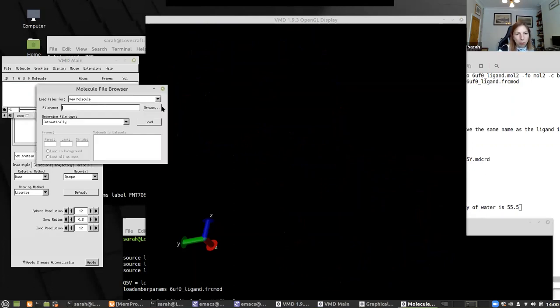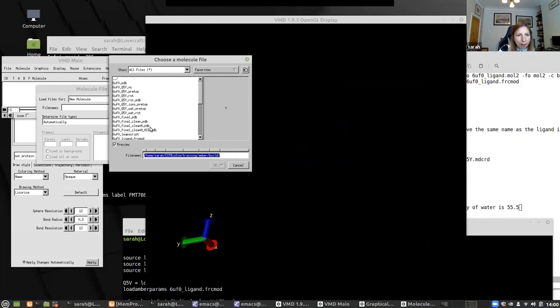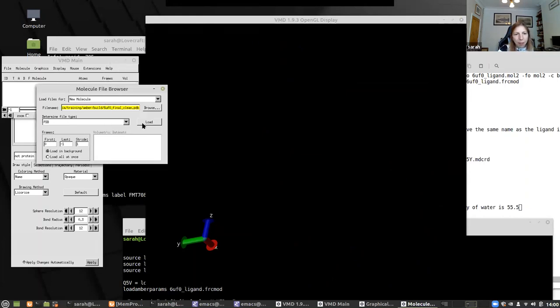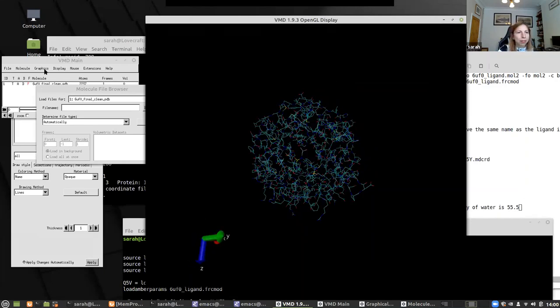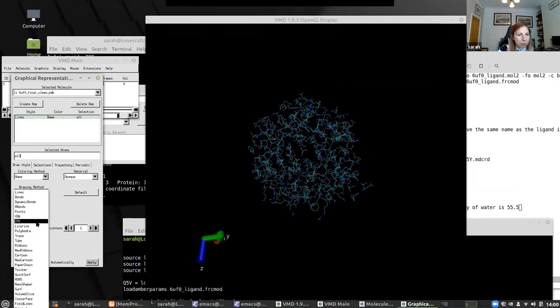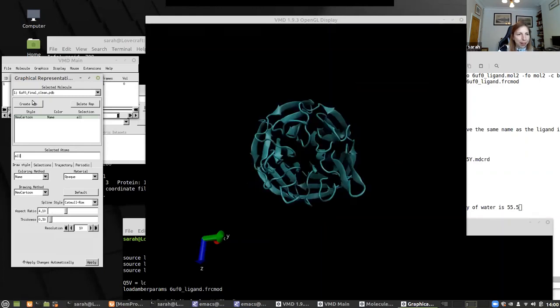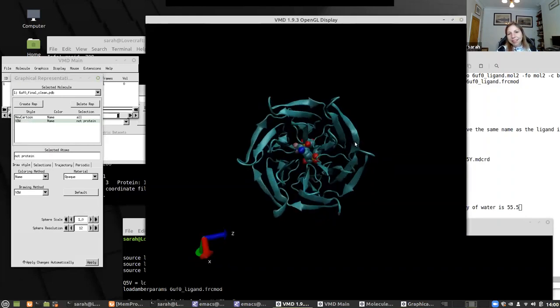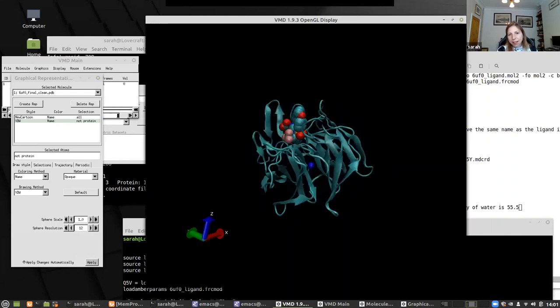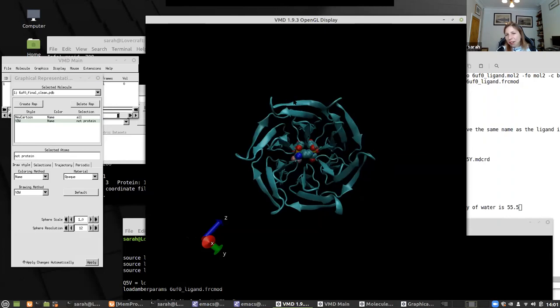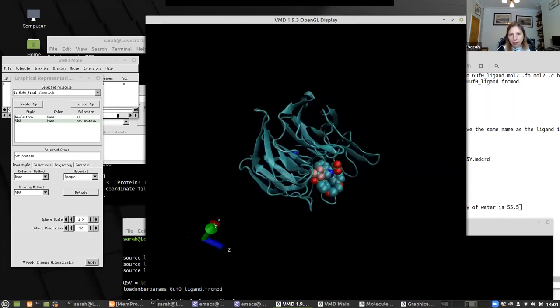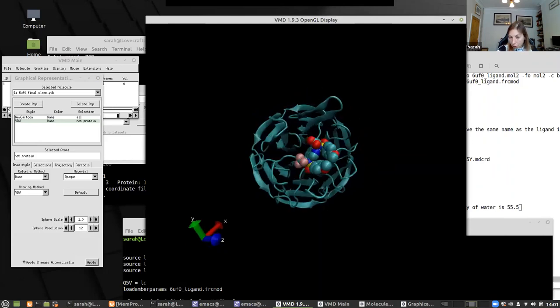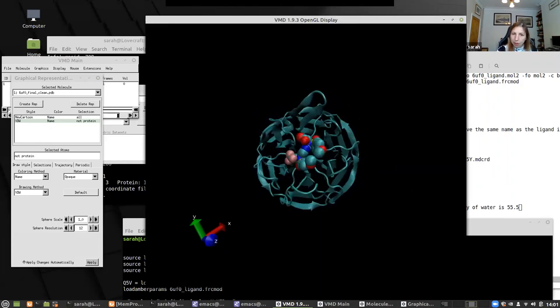Loading the cleaned file — 6ufo_clean.pdb. There's our ligand, there's our protein. And I kept the sodium because it looked important, seeming quite embedded in the channel. So this is what we're going to run a simulation of, now that we've deleted all the unwanted material from the outside.